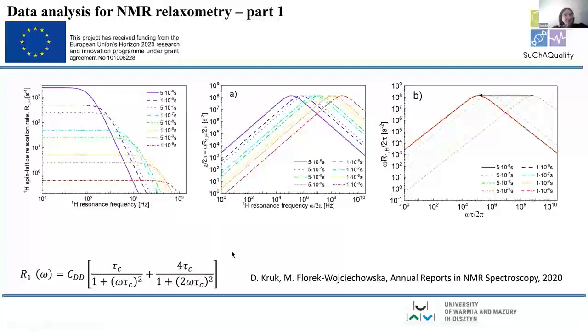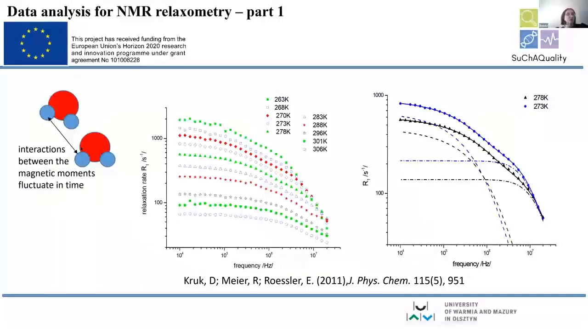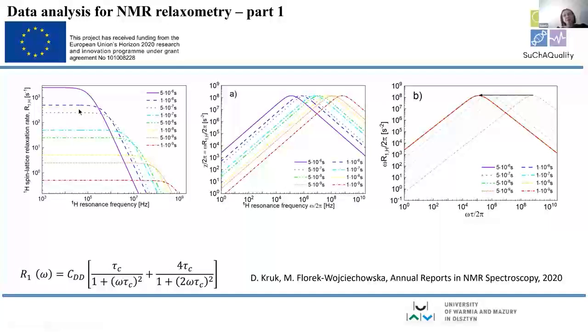It links relaxation rate with dynamics. How? The BPP comes from Bloembergen, Purcell, Pound, an abbreviation of the names of the people who derived those expressions. What does this expression tell us? It is valid for a very simple system, like for instance an isolated water molecule, just one water molecule. Because if one wants to develop something, one should start with something simple. This formula was derived many, many years ago, at the beginning of NMR. And the trouble is that people still use it. Actually, I really pay tribute to the authors of this theory.